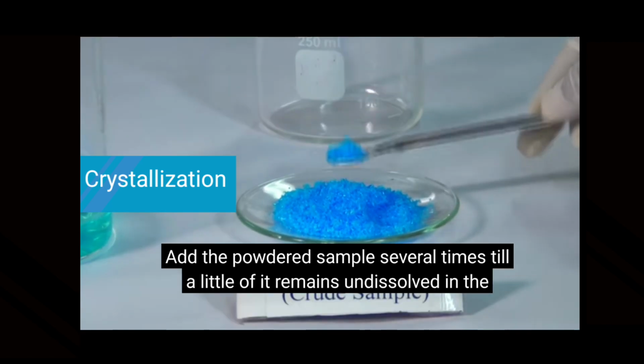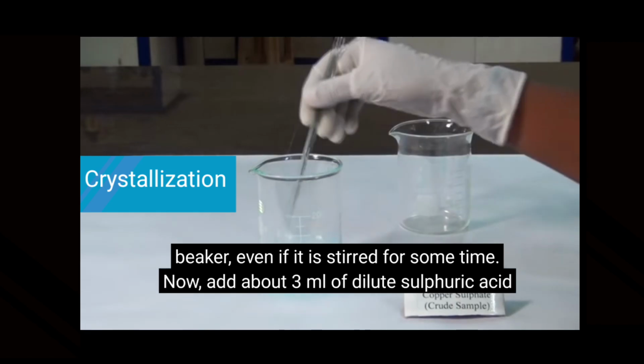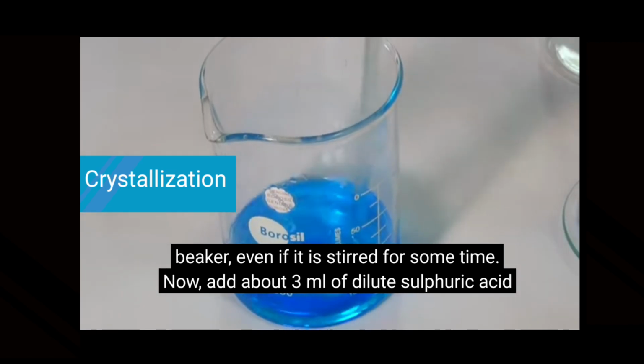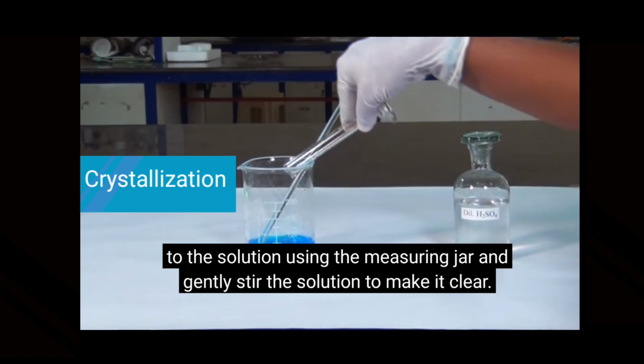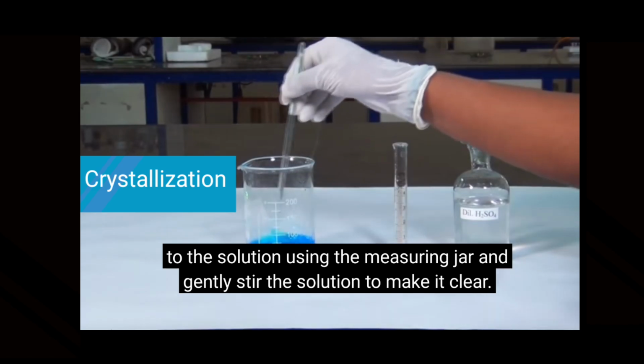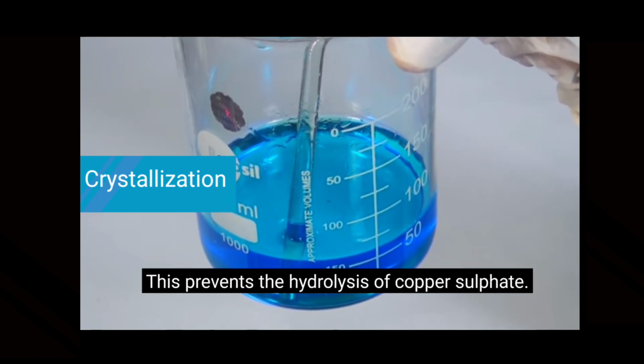Add the powdered sample several times till a little of it remains undissolved in the beaker, even if it is stirred for some time. Now, add about 3 ml of dilute sulfuric acid to the solution using the measuring jar and gently stir the solution to make it clear. This prevents the hydrolysis of copper sulphate.